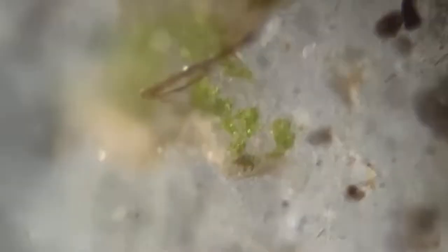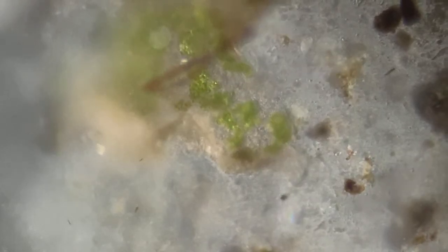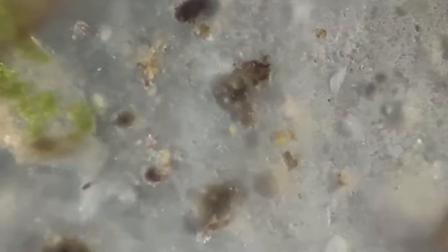See, the true color is being reflected. It's not the transversed or pierced color, but the true color of the object, the sample that we have. I'll go back to the 10x, 4x.